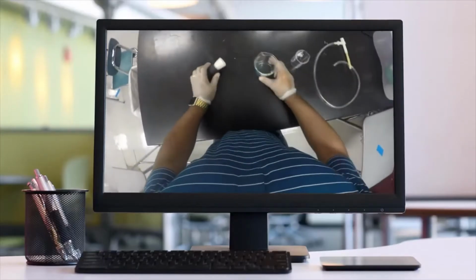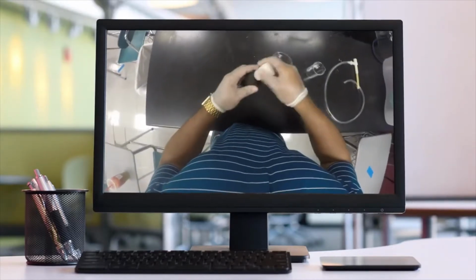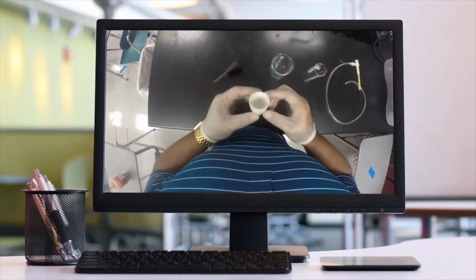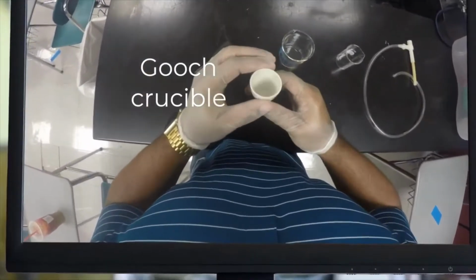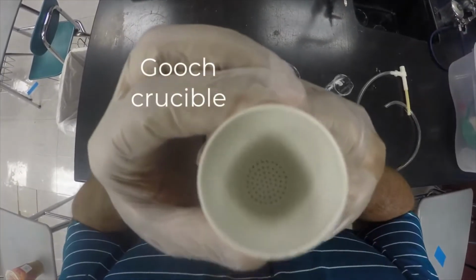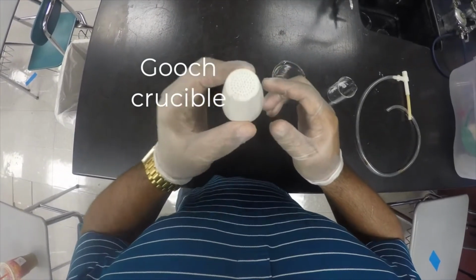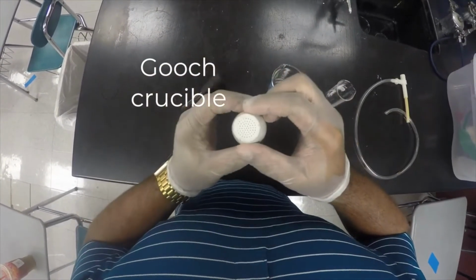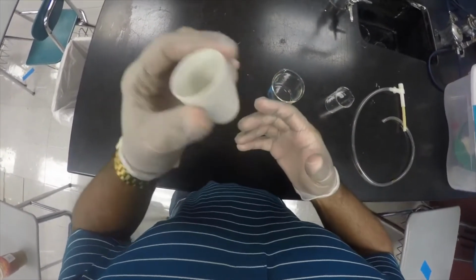Okay, so I just want to introduce you to a little bit of glassware. This first device is something called a Gooch crucible, and basically we'll be using this to filter the materials. If you look very closely, you'll see that there are holes through which liquids may be pulled through the filter glass.